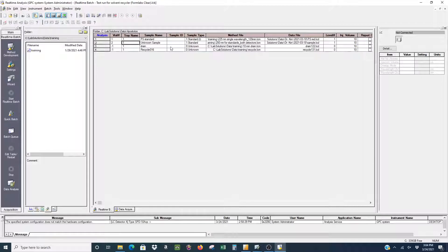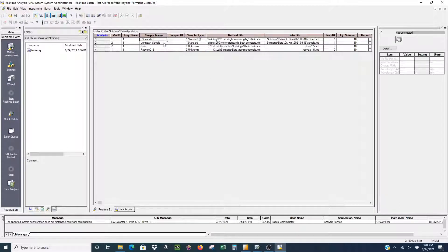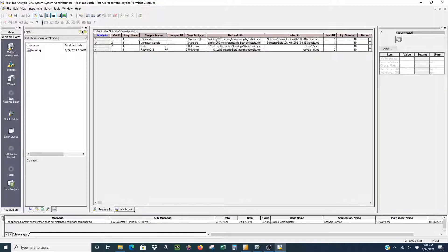Now we can see all of the other samples that we have. We have our standard as well as our unknown sample, our drain cycle, and our recycle cycle.